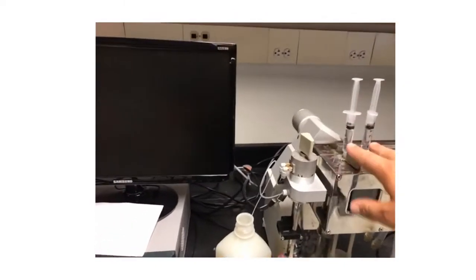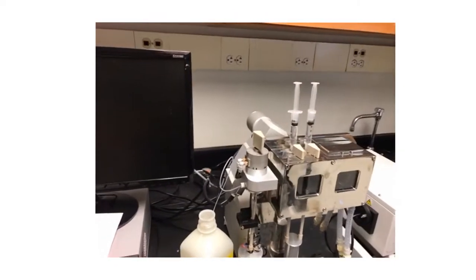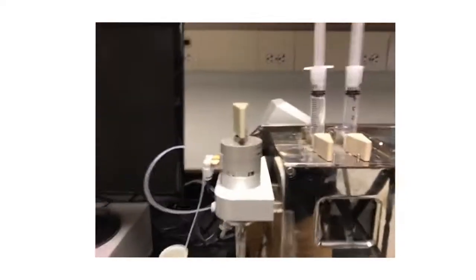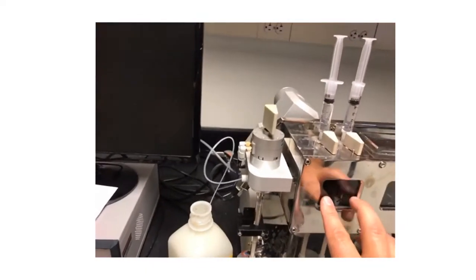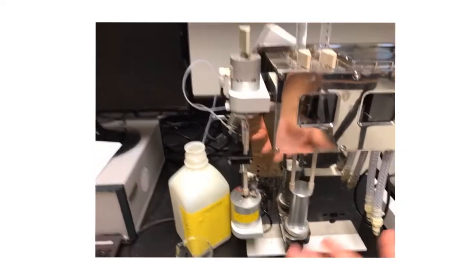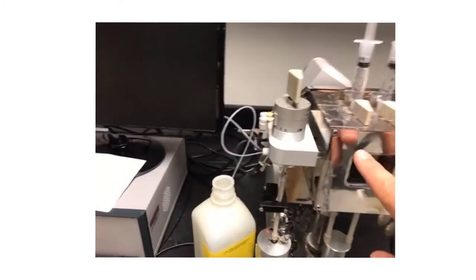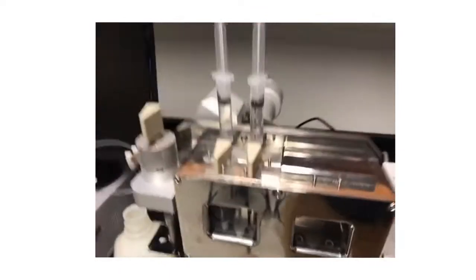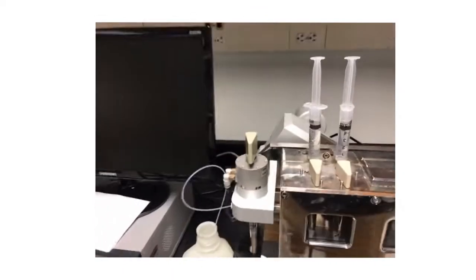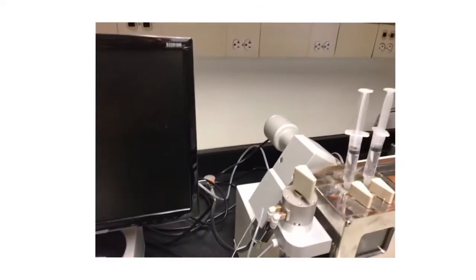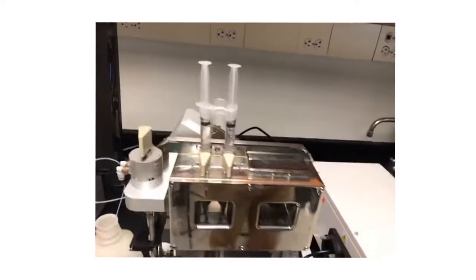Then we have a fiber optic that leads the light to our reaction area. We have the ability to add two reactants, so we'd add them separately. These are maybe hard to see, but there's two little syringes in here that would have our reactants, and then we have a mechanism that we can drive to push those two reactants together, sort of right behind where the syringes are, through the reaction area here, where we can follow the reaction that takes place using UV-Vis absorbance or UV-Vis fluorescence microscopy.